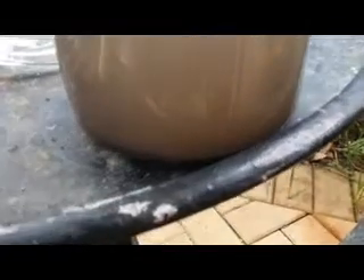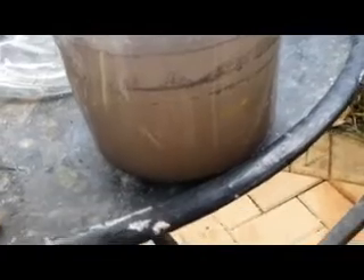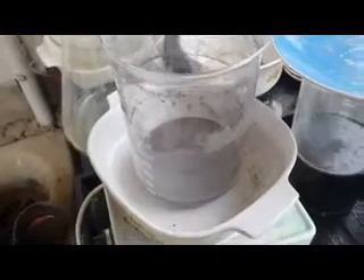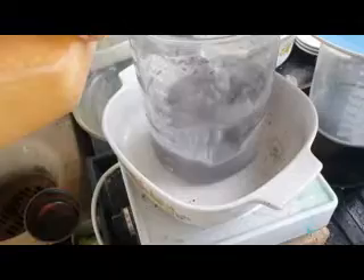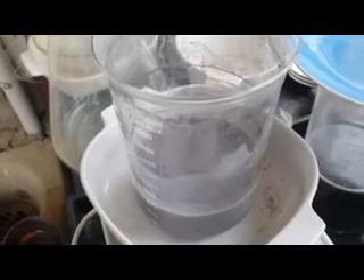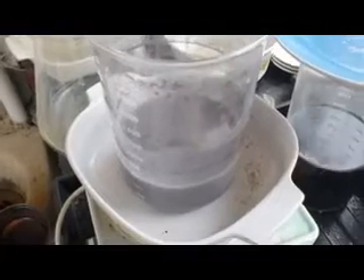This has been rinsed nine times so far and it's at the stage now where it's just settling down. Once it settles down I'll pour this off and show you the next step. Now I've poured off the water, I'm going to put some hydrochloric acid in there and give it a boil. Hydrochloric acid will not dissolve silver, but it does dissolve other base metals.